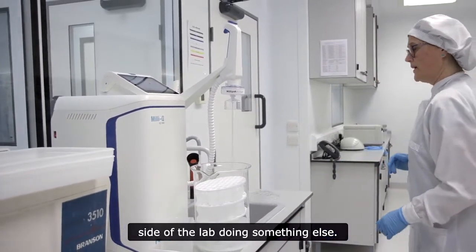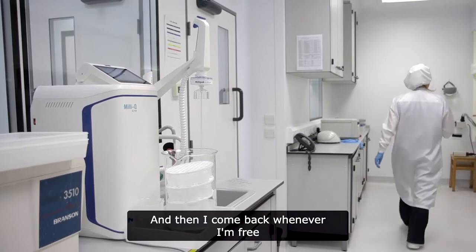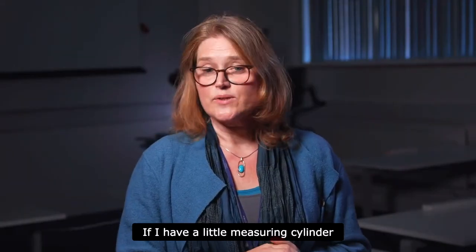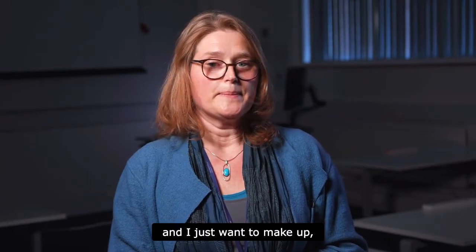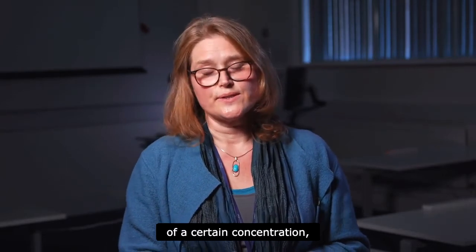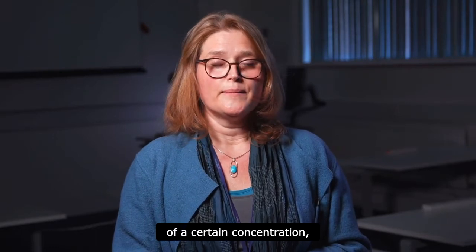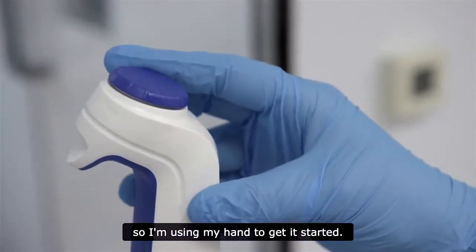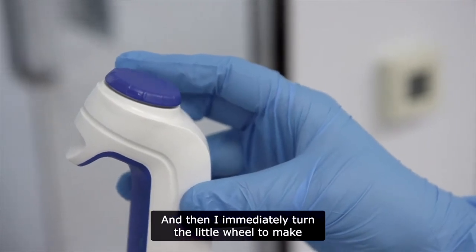Then I come back whenever I'm free. If I have a small measuring cylinder and just want to make up, say, 100 millilitres of a certain concentration, I really like the little features — I use my hand to get it started and then turn the wheel to fill it up very slowly to where I want.